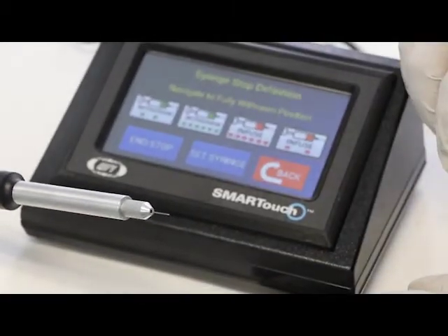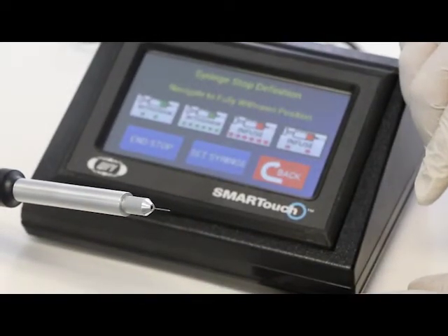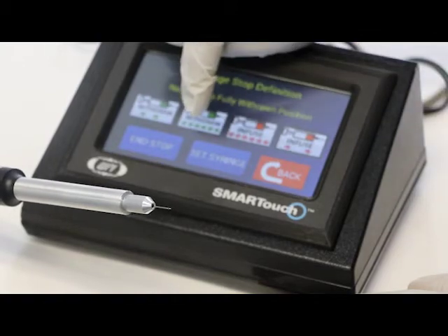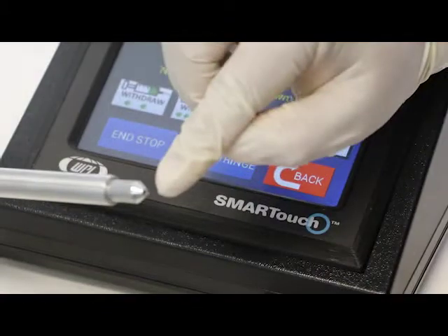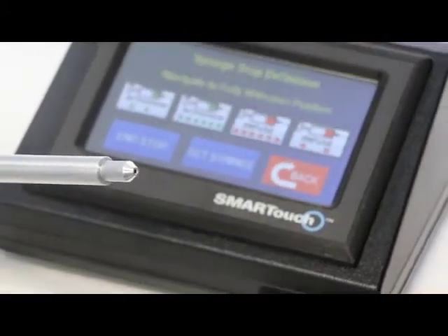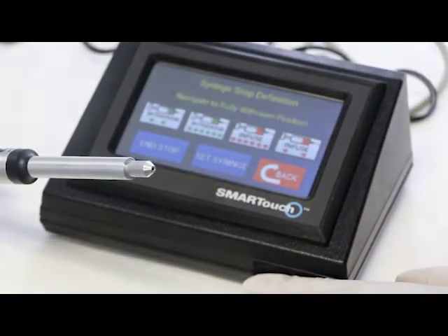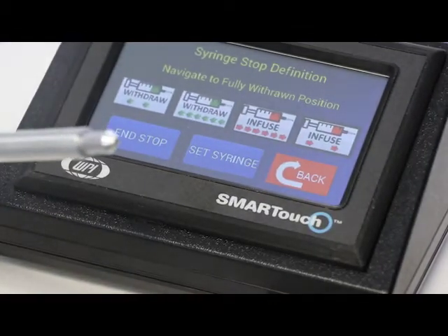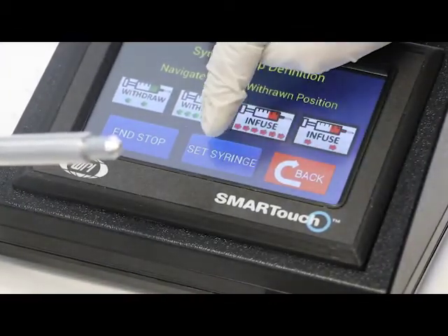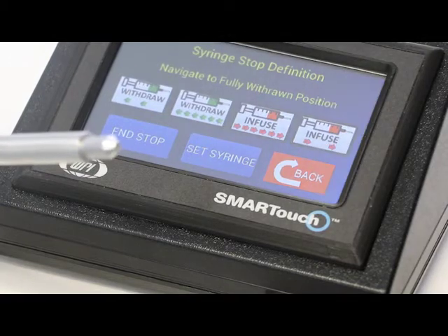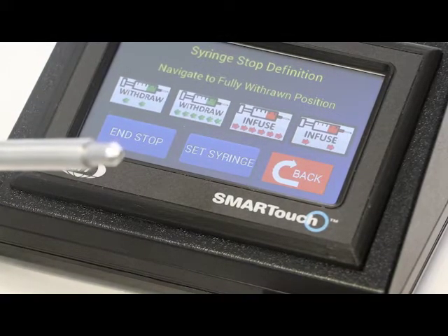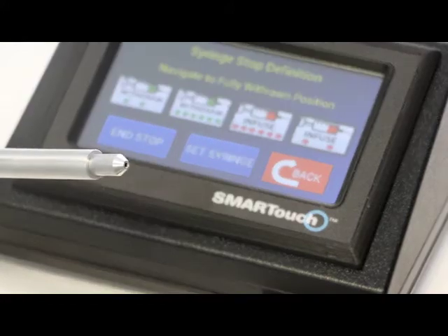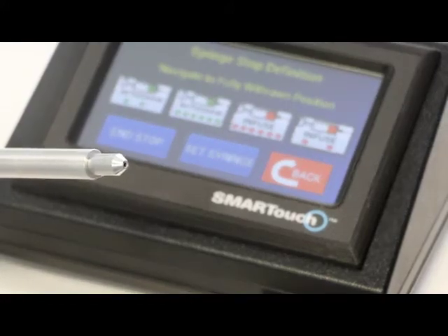Now to set the home position you're going to bring the plunger back to right under the collar. When you have the plunger right under the inside of the collar, you're going to hit set syringe. And this has set the plunger to this home position. And anytime you want the plunger to come back to the home position, this is the position.